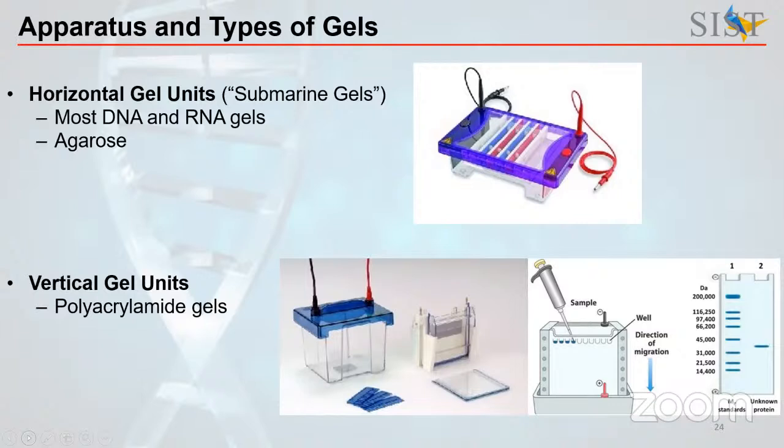So in this case, the gel we normally use is agarose. This agarose is obtained from a marine algae, specifically sea kelp. It exists in powdered form normally. When you dissolve it in a buffer, it doesn't dissolve fully at room temperature. So in order to make it totally dissolved, you'll have to boil it. The heating of this agarose should be at least above 80 degrees Celsius. And then the agarose will totally dissolve and it will come in a liquid form. When it is cooling down, it will become solidified. So that's the use of agarose.